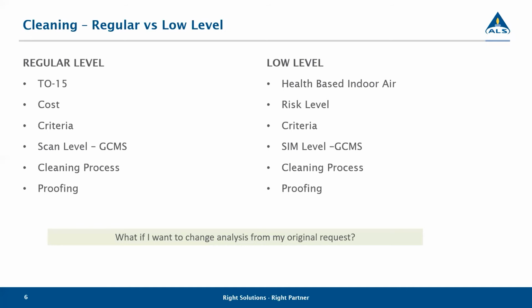I would say the vast majority of clients, when they call us to change the testing that they need, we can provide that. But there are times when, if we haven't looked at the total petroleum hydrocarbon fractions 1 and 2, so your gas, diesel, and the canister wasn't requested for that, there may be a switch that has to happen. So always keep in mind that it's not impossible to switch, but that's why we ask in advance what you're looking for as far as analysis, because we make sure that that individual proof passes that with no question.